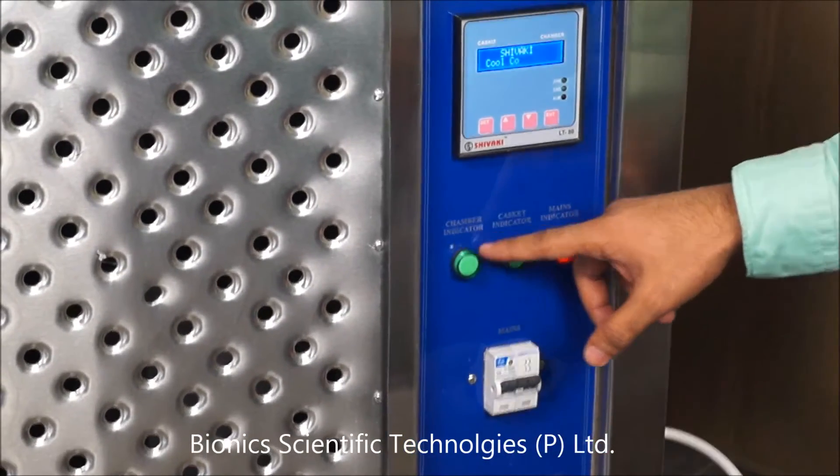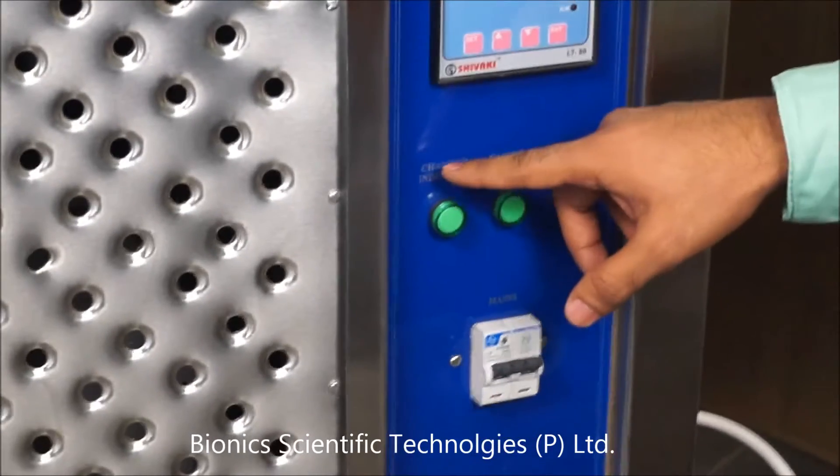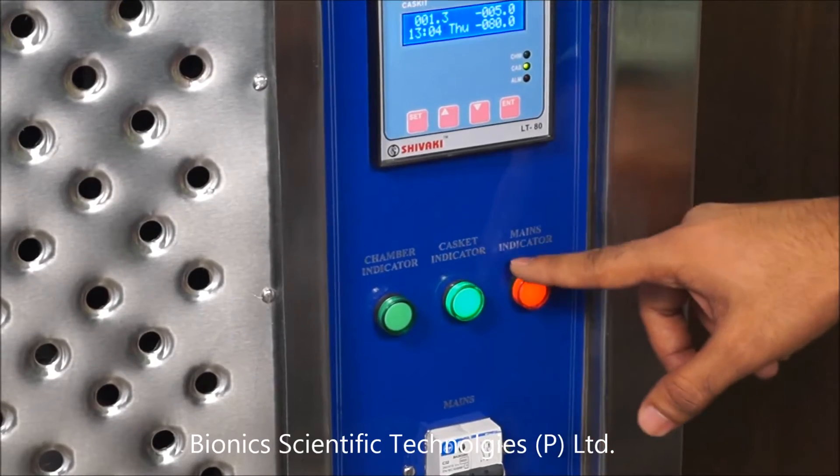And these are the three indicators. This one is for chamber, this one is for cascade, and this one is for mains.